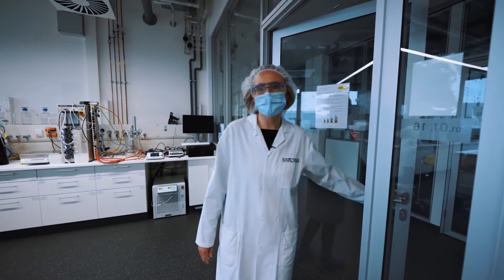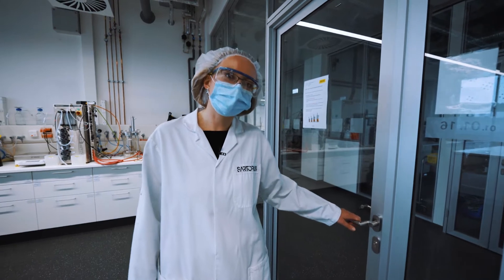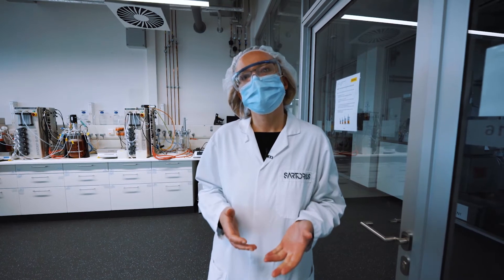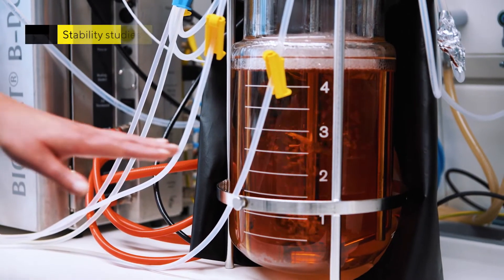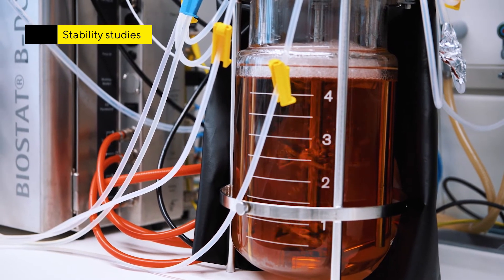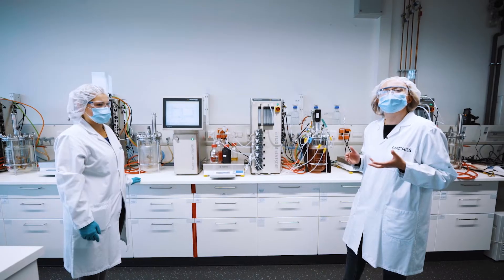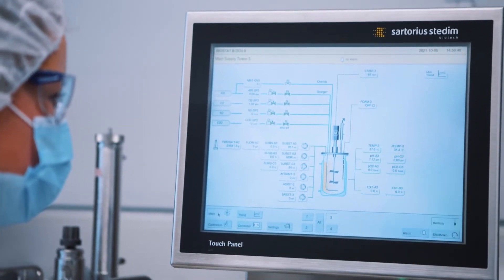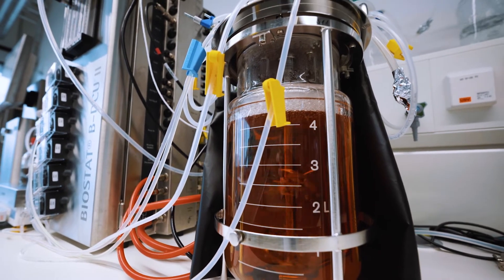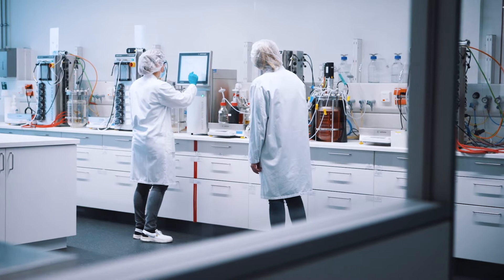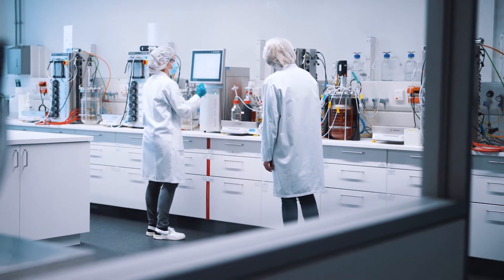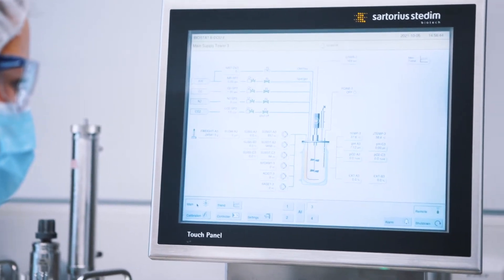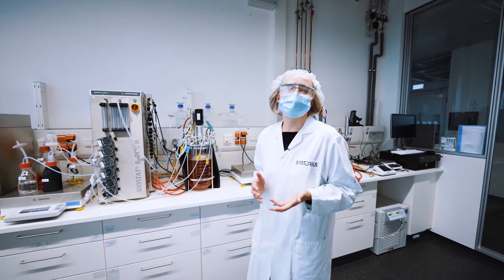Here we are now at our bioreactor lab. After the top clones have been selected in clone screening, the research cell bank is prepared and the clones are submitted to a stability study. The customer then receives all the bioreactor data and an upstream transfer protocol which contains all the important parameters of the bioreactor — the starting point for the customer for further upscaling at their lab or their selected CMO. The customer also receives harvest material from the fed-batch bioreactor, which is very useful for early development studies.